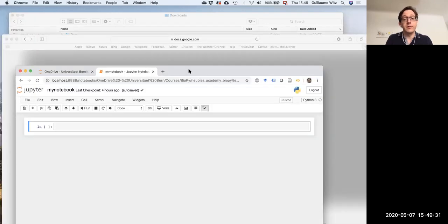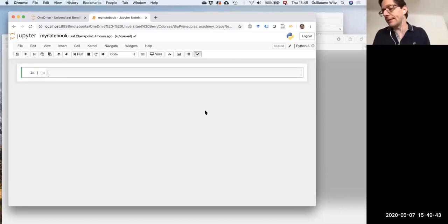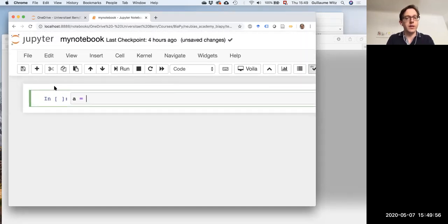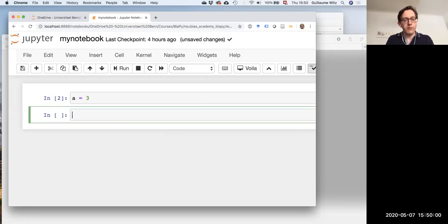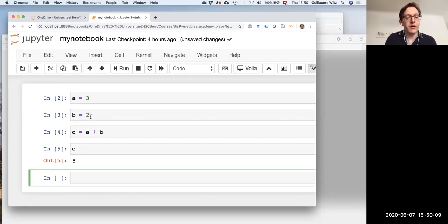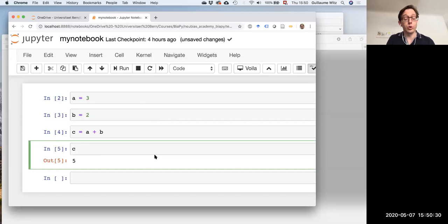So this is a notebook as it would appear in your browser — this one is running on my own computer. We will run these things remotely and you'll see it looks exactly the same way whether running locally or remotely. I can start typing code in a cell, define a few variables, combine them, and see the output. Whenever you just have one variable and execute the cell, you see the content of that variable. The variables you define are available for the whole notebook — not just per cell. Whatever you write in a cell is shared across the notebook.